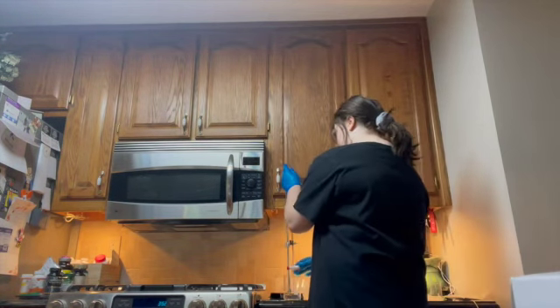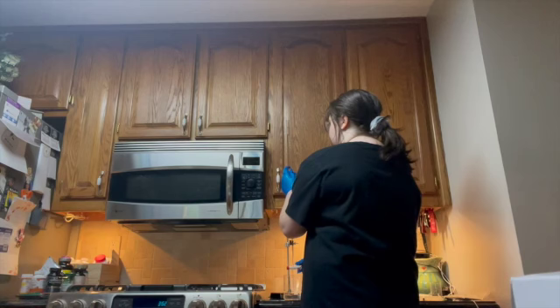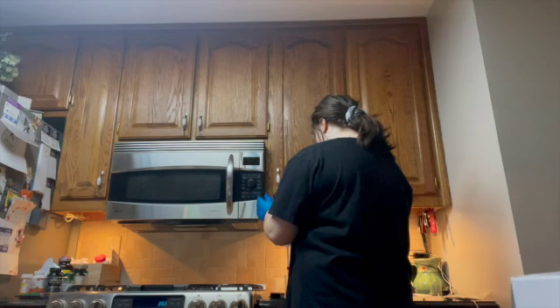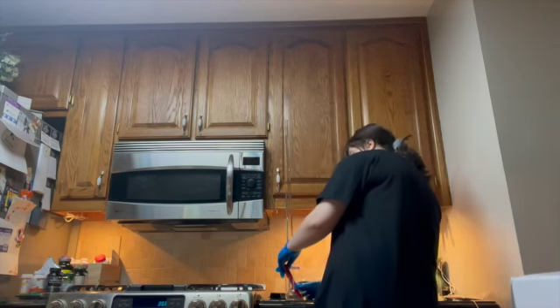Okay, so here we go. Now about to titrate 1 milliliter, and there we go. Now let me swirl it for a sec, and now let me test its pH, and on camera I'll tell you.